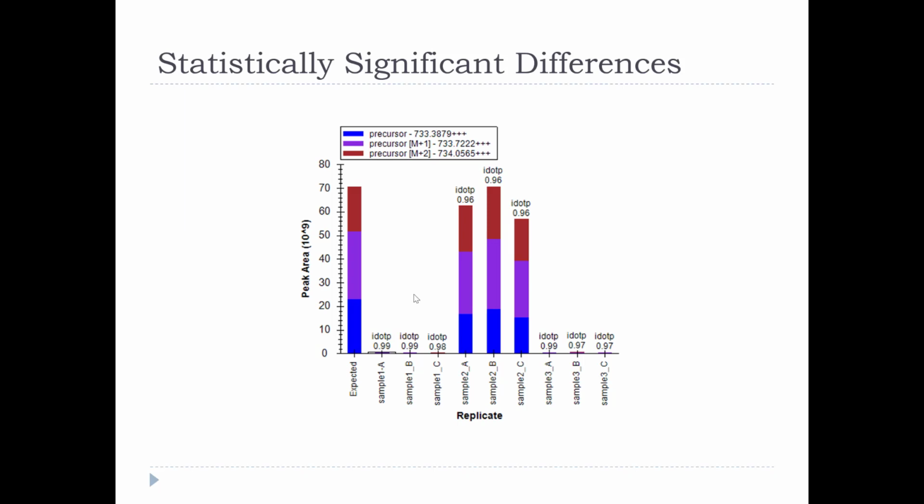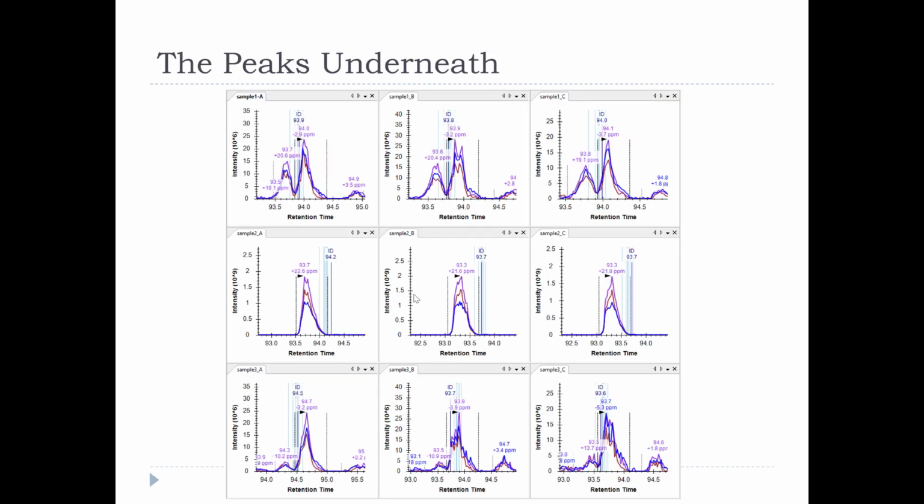If we just go straight to the satellite view and then pump it through MS Stats, we're going to get, yes, this is totally interesting. And one of the nice things is that after MS Stats tells you it's totally interesting, that's how I found this. I used this statistical tool and it said, wow, that's totally interesting. Then I went and looked at all the totally interesting things, and some of them had these problems. So you can do this after the fact too.